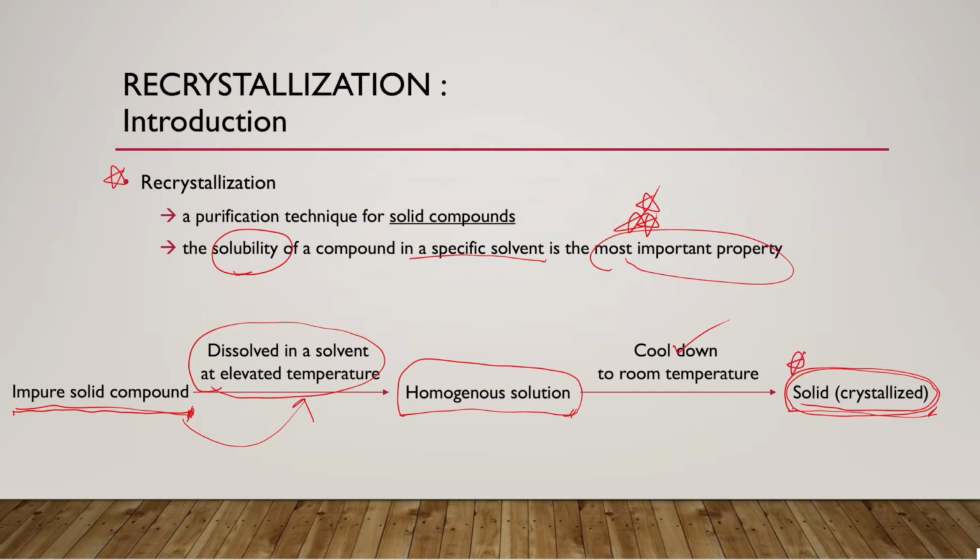But in this recrystallization process, all the impurities are left behind in the solution. So let's say in a container, we have our compound in a homogeneous solution.